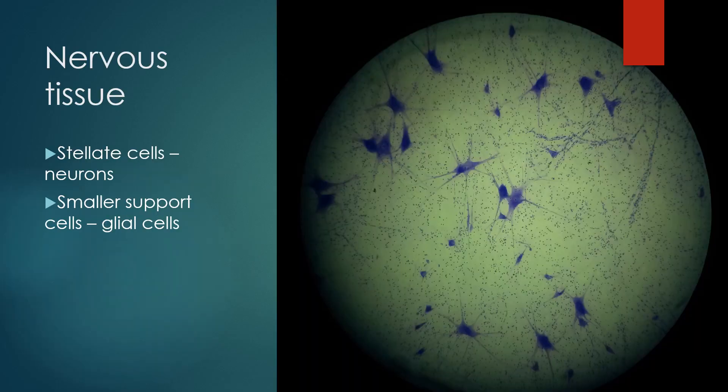The first microscope station had a nervous tissue slide. This is the actual slide that you all looked at. I took these photos with my phone camera after you had finished taking the test. Nervous tissue is an excitable tissue that our body uses to send signals for internal communication and sensing external stimuli. The cells that perform that communication function are known as neurons, and they are stellate, meaning they are roughly star-shaped.